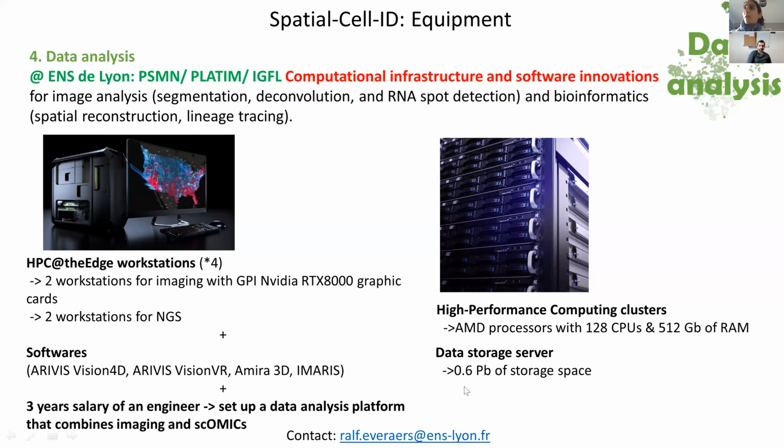Also storage space, because this type of data is very heavy in storage, especially images. Then with that, we will also have 4 workstations, 2 dedicated for image analysis with some special software for image analysis, and 2 workstations for NGS analysis.